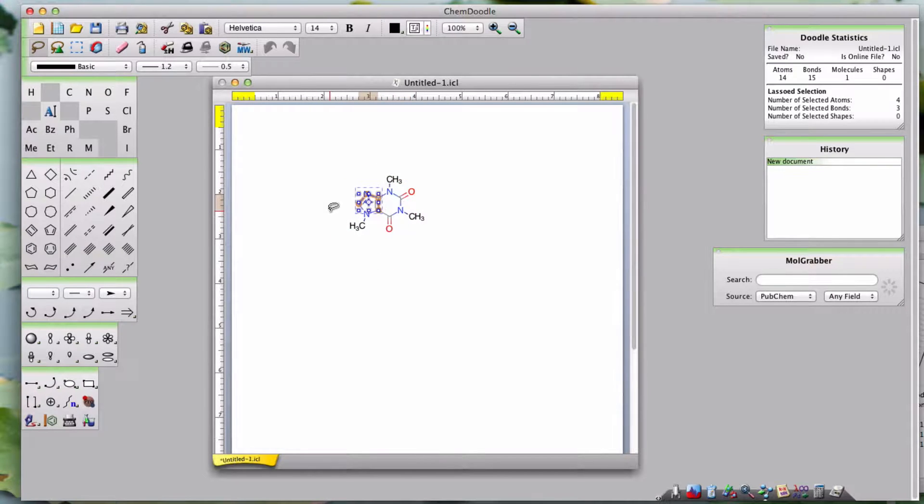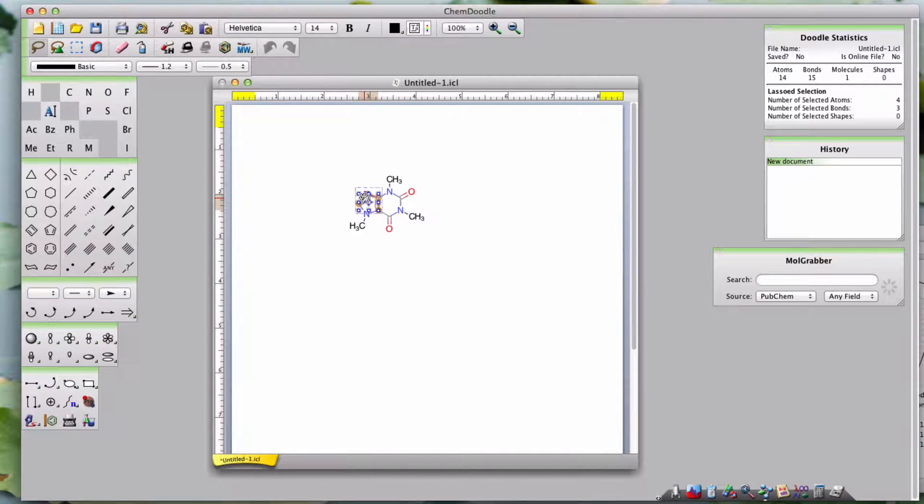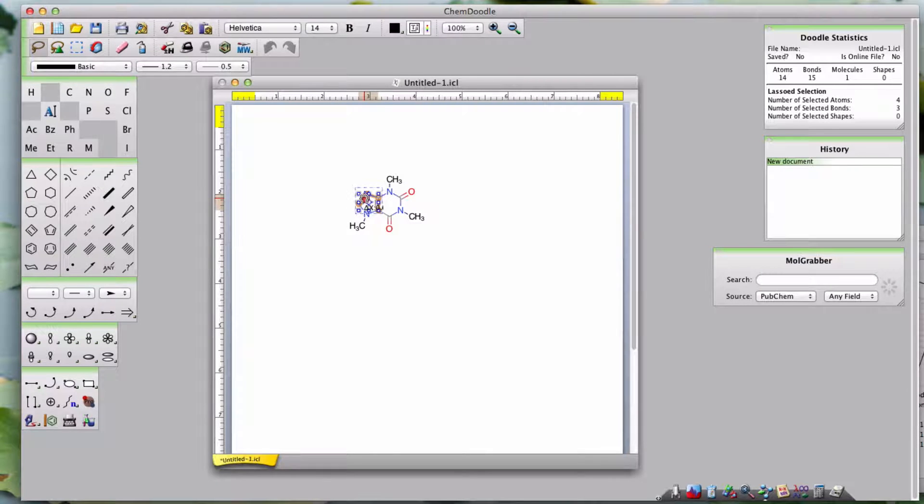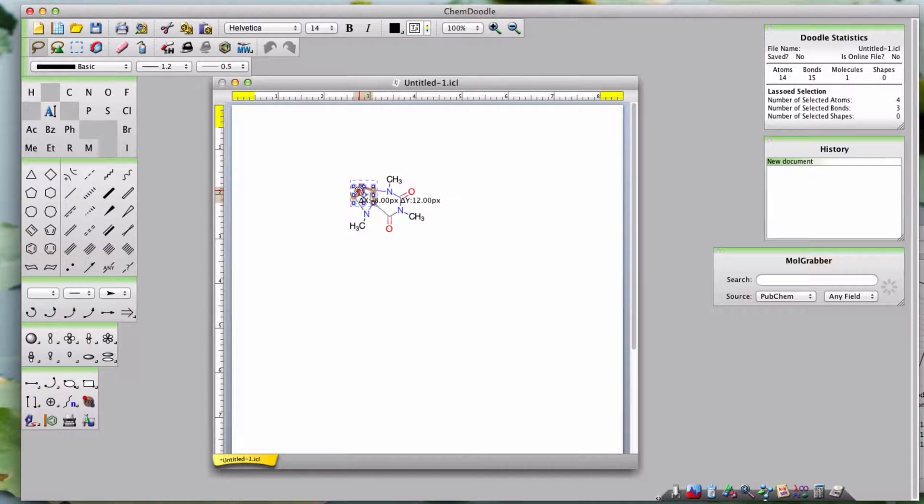If you then hover over your selection, you'll see the grabbing cursor, which in turn will turn into the grabbed cursor once you click and begin to drag the content around.